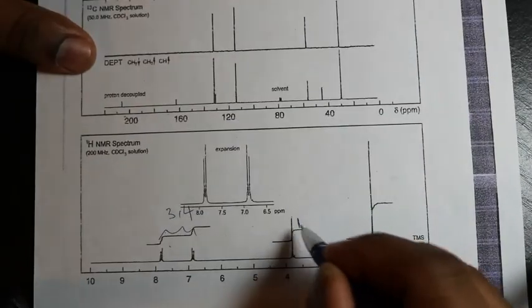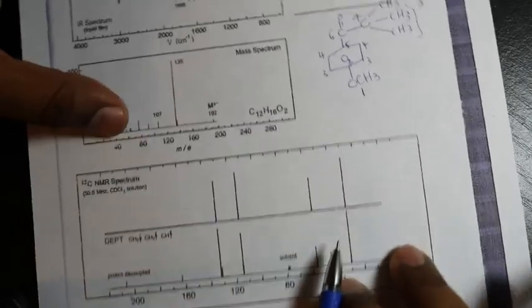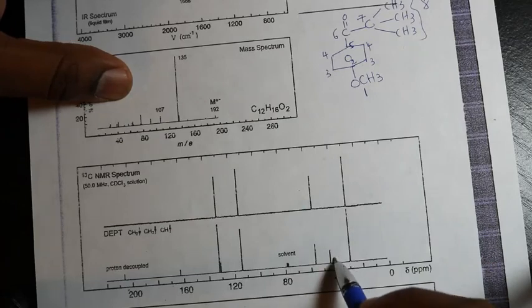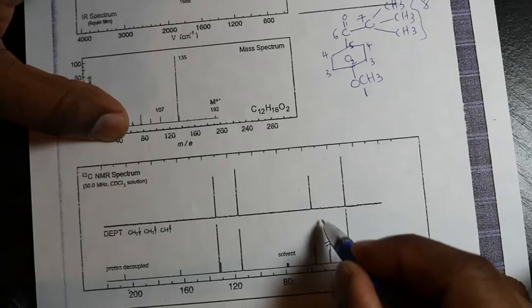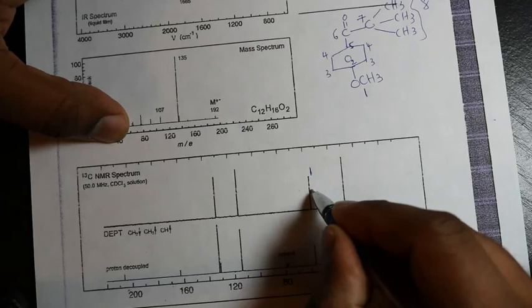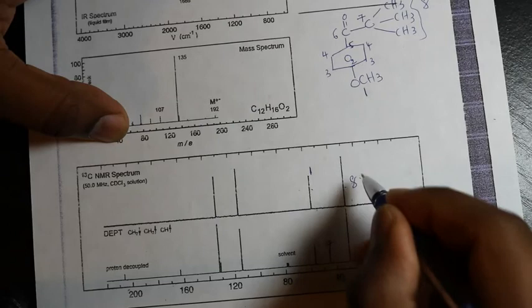And the OCH3 is 1, so I'd say 1 here, and the 3 CH3s, this is 8. And also for carbon NMR, this will be the quaternary carbon, it's 7, and this is primary, the methoxy carbon, and this peak belongs to 8.